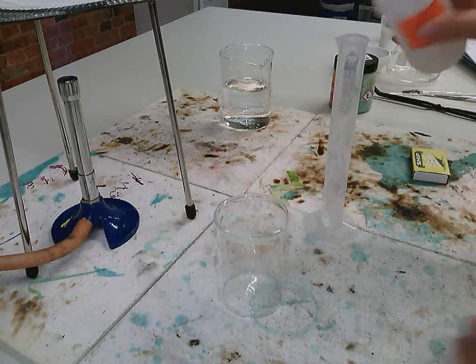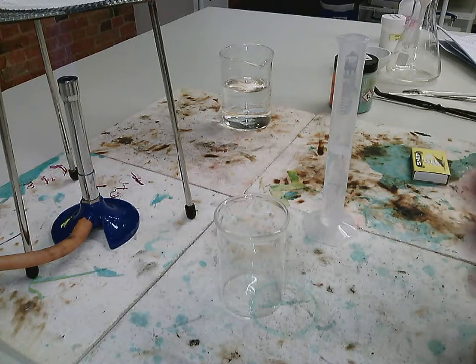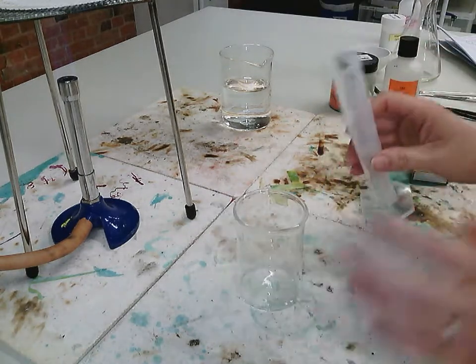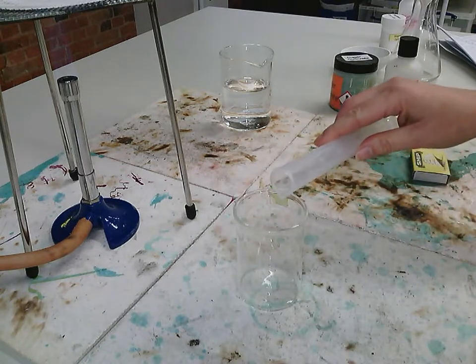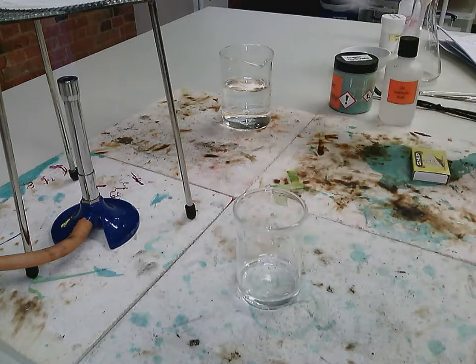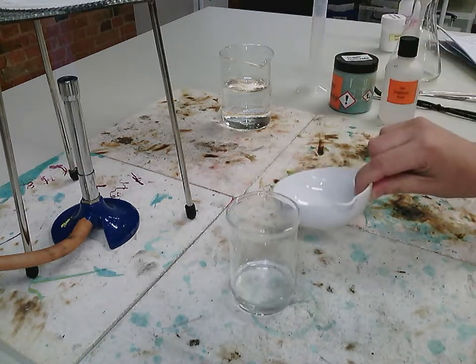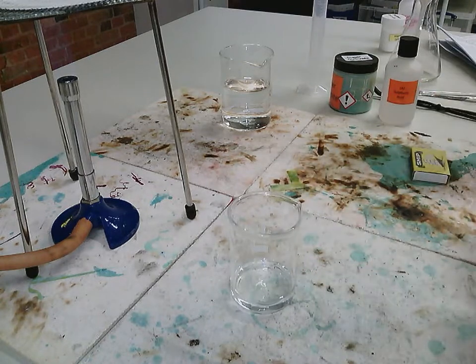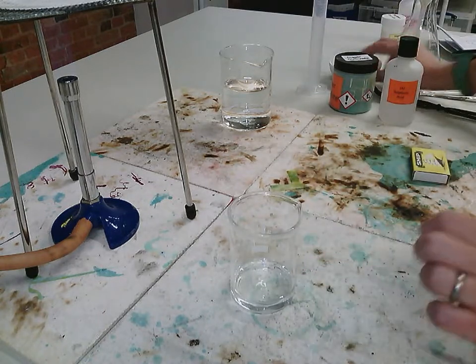It doesn't matter if it's 15 ml, 10 ml, or what. As long as you write a volume and it's not ridiculous, you get the mark. But if you don't put in a set amount, you won't get any marks. So just give a number, a random number. I'm using 15 because it needs to go in my evaporating basin. I want it to react quite quickly for this video, so I've only used a small amount.